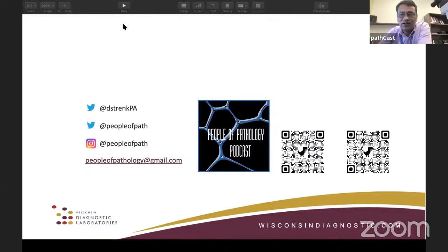So the standard of care also has to be a shave margin, because in a tubular structure, say for example, we are looking at signet ring cell carcinoma of the stomach. Even if the tumor grossly is far away, the signet ring cell carcinoma is notorious to diffusely spread. So if we by mistake submit a perpendicular margin, which is really not representative, it can misguide us, because at least we need to submit the shave margins so that if there is any chance, we might find some tumor cells, and without that, I think it won't be correct.